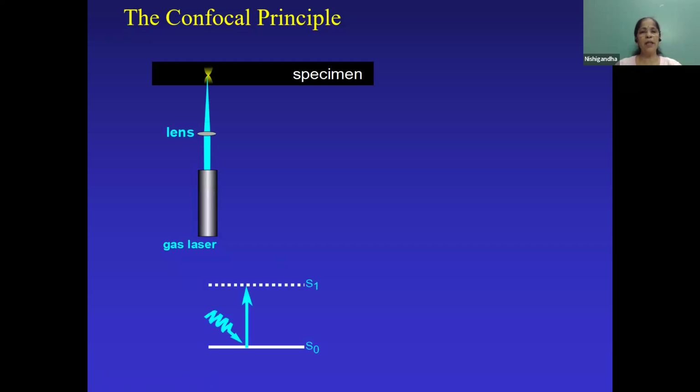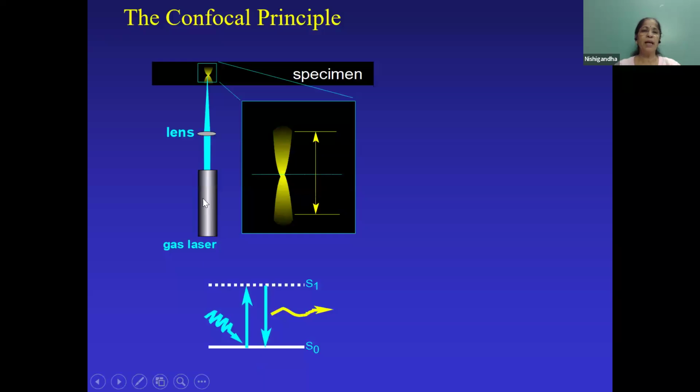This is just a little better elaboration of how the confocal principle works. You can see a blue gas laser which is illuminating the specimen. This is just an enlarged view of that.